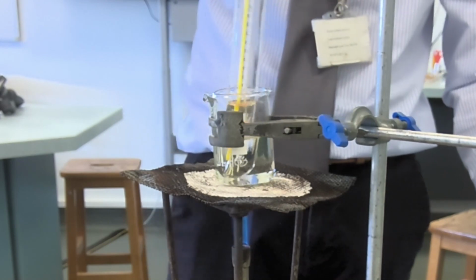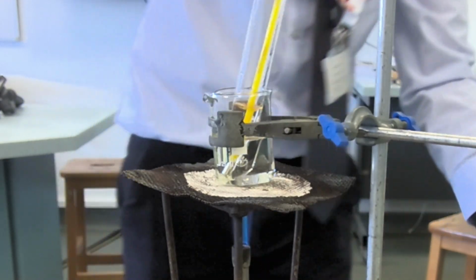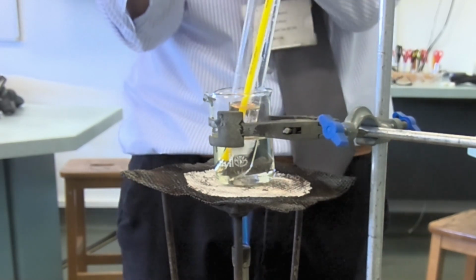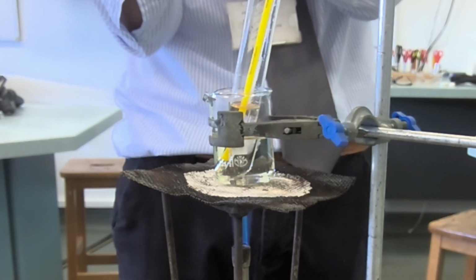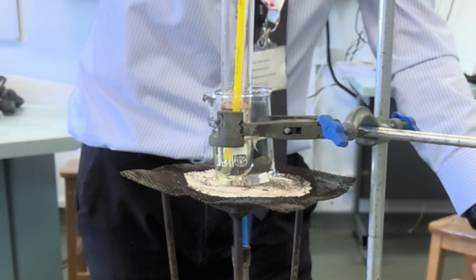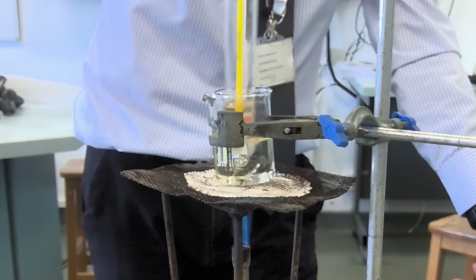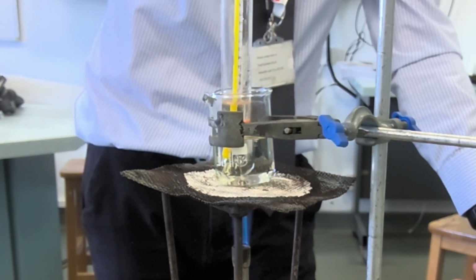So at this point, I'll have a little check. Is it still solid? Yes, it's really easy. If you turn the thing so that the crystals are right, it's got the mercury bulb behind it. Again, that's quite a nice background to look at to see. So we're at 100. What did we say we're supposed to be? Target 122. Mm-hmm. So starting to get a little bit closer to the cut-off point now, where I turn the Bunsen off.